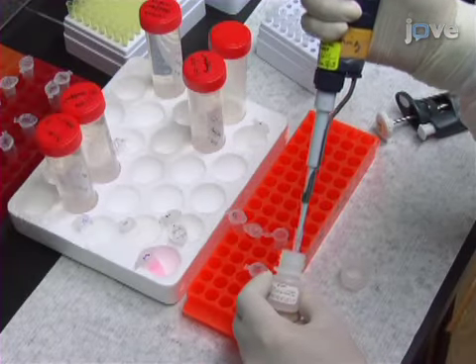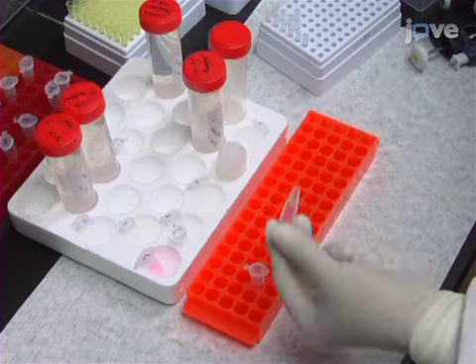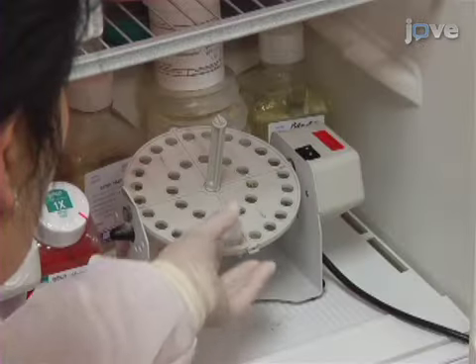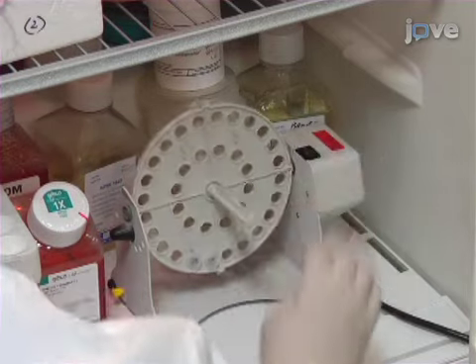Also prepare a negative control in which the lysate is combined with resin in the absence of either peptide. Incubate the mixtures at 4 degrees Celsius overnight with end-over-end rotation.